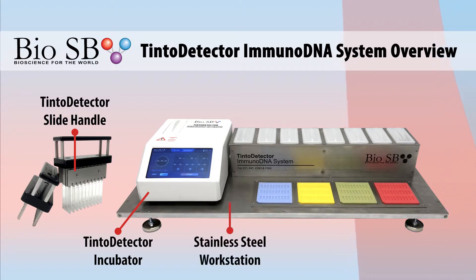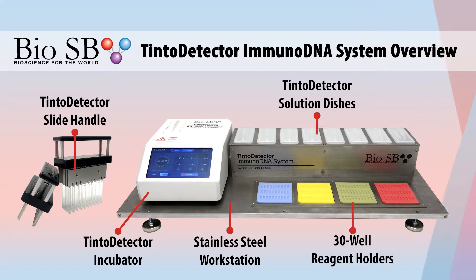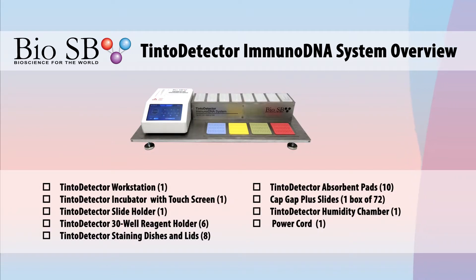The BioSB Tinto Detector ImmunoDNA System comes with everything you see here, including the slide handle, incubator, stainless steel workstation, reagent holders, staining dishes, and cap-gap plus slides.